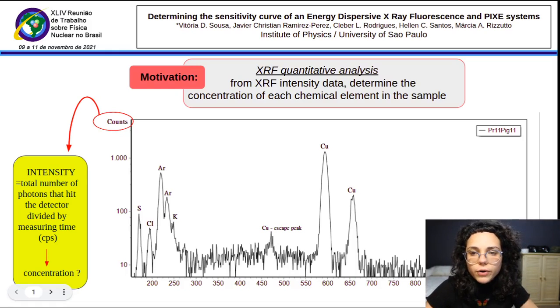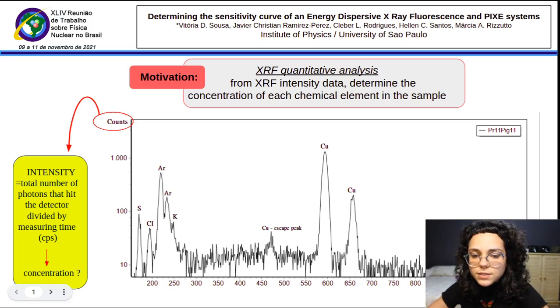I'm part of the Laboratory of Archaeometry and Sciences Applied to Cultural Heritage, and I'm here to talk about the sensitivity curve of an X-ray fluorescence or PIXE system, a project developed under the supervision of Professor Marcia Rizzuto.